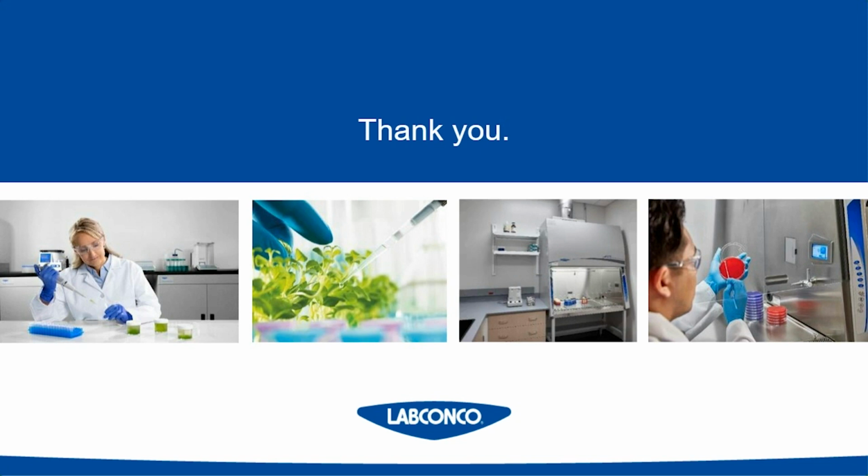All right, our next question here, how do I know what BSC is best for my specific biohazard? That's another really good question, and one that we get quite often. When it comes down to working with biohazards, all types of biosafety cabinets are equally safe. However, what you need to be really specific on is what is required for your biohazard in terms of personal protective equipment, or PPE.